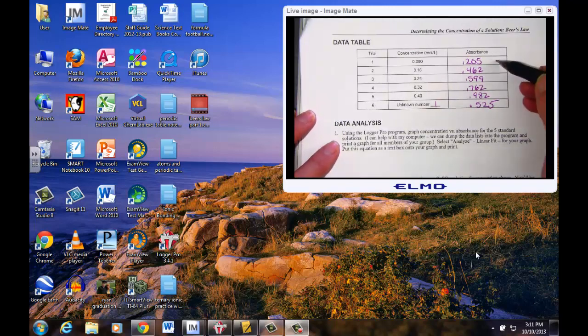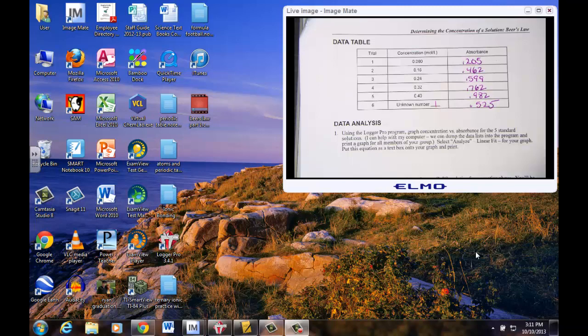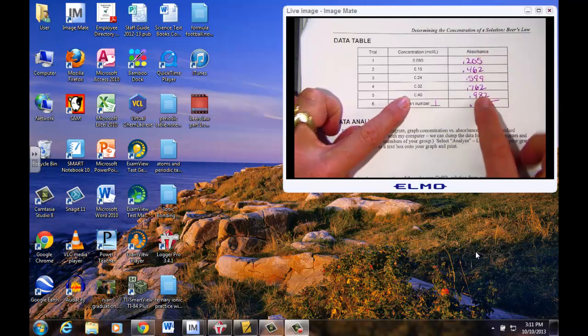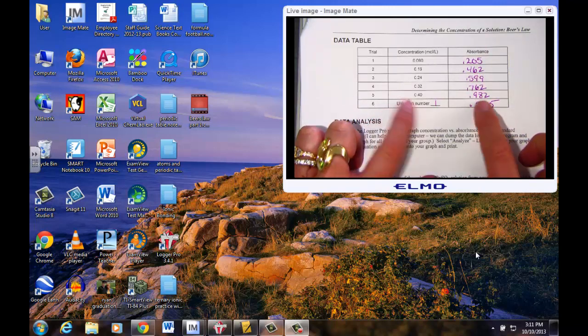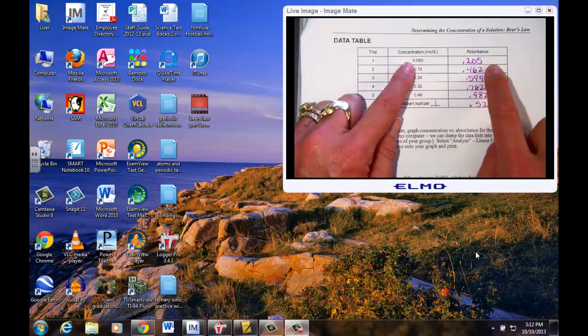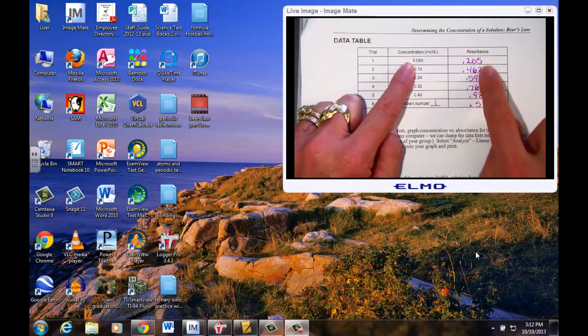Just to have some sample data, I took the liberty of just making up some numbers. They may or may not come close to yours. But it's going to provide me some numbers to process using the LoggerPro program. So at this point I have 0.08 molar and I have 0.4 molar and the range between them. Just a quick observation with your own numbers: the most concentrated solution should have indeed absorbed the most light. It was the most intense of the colors. The least concentrated solution had the least amount of light absorbed, and you should see that trend in a linear fashion.